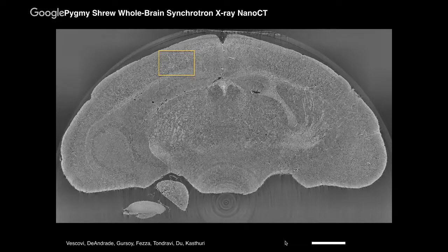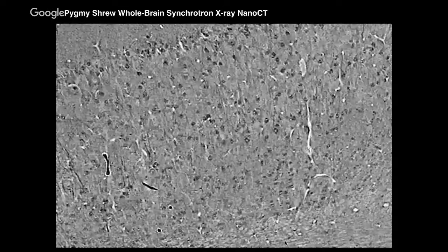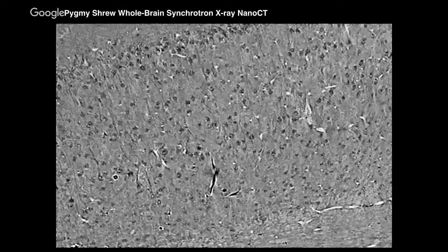And this is showing pygmy shrew, just a single slice about midway through the brain. I'm not sure what resolution you guys can see on your end, but what I see here is a bunch of little dots, which are cell bodies. Now, if you zoom in on that yellow box and do a fly through of about 1,000 sections, you would see this.